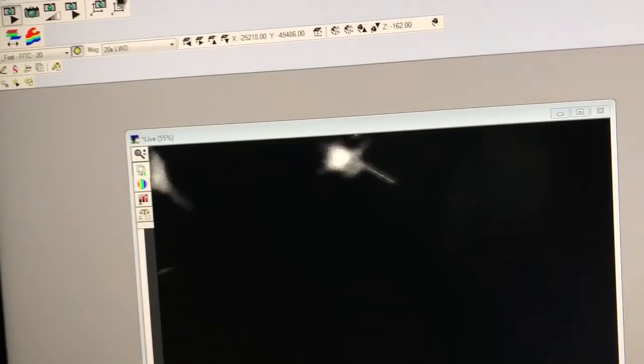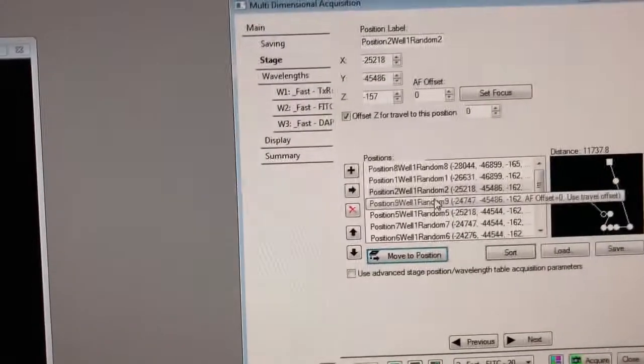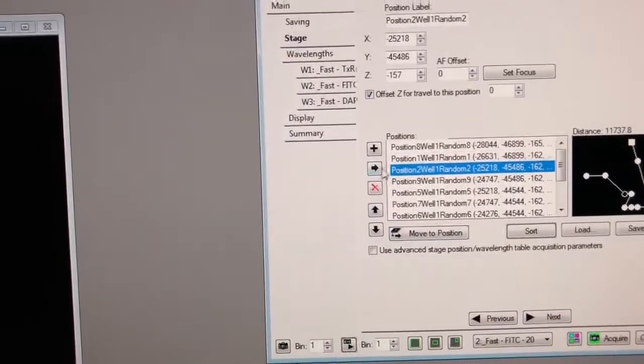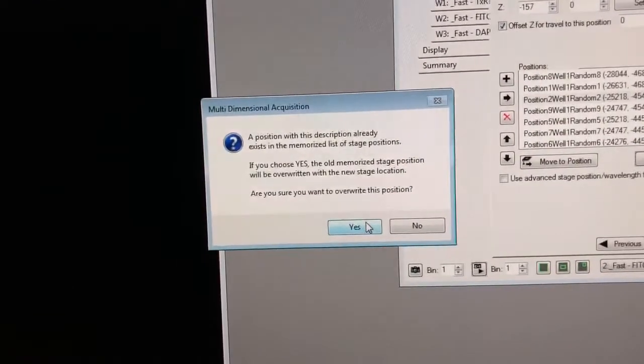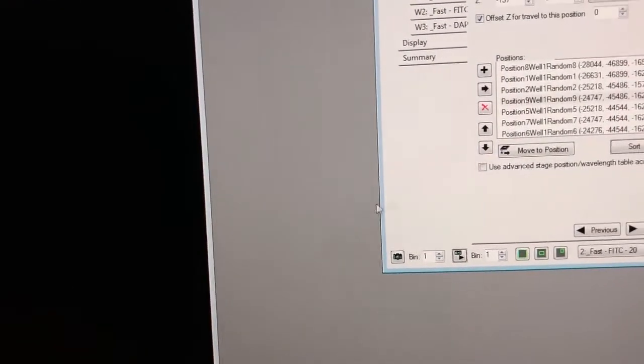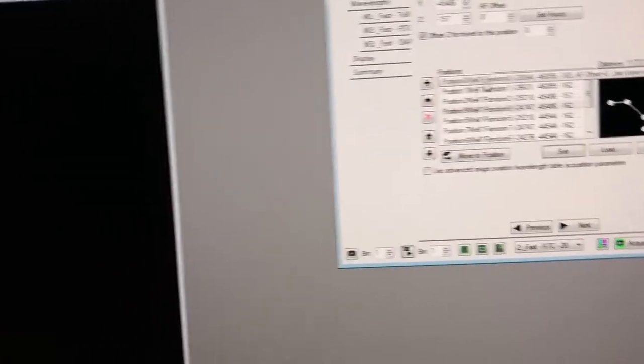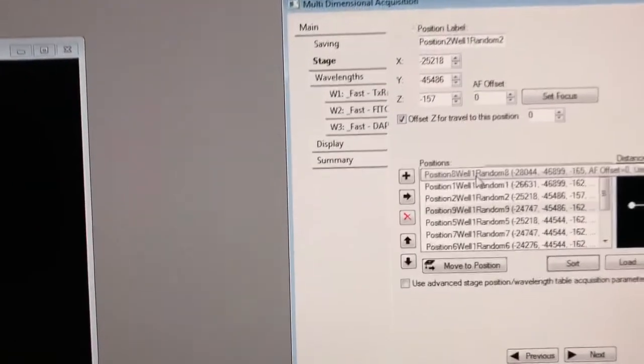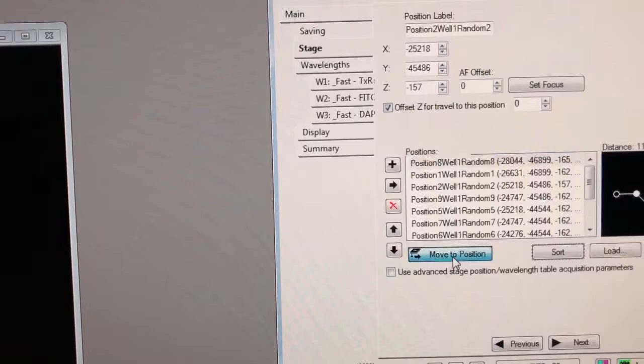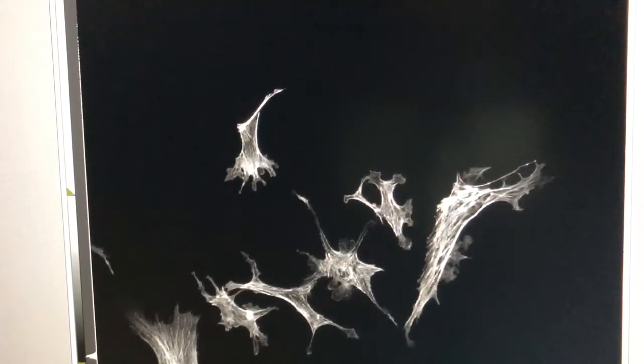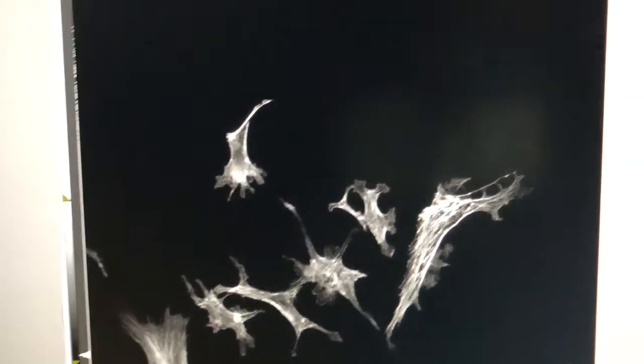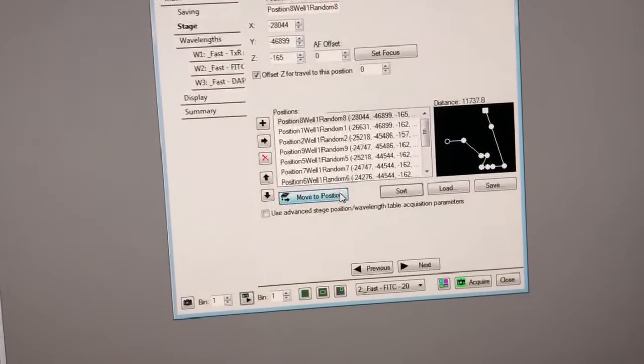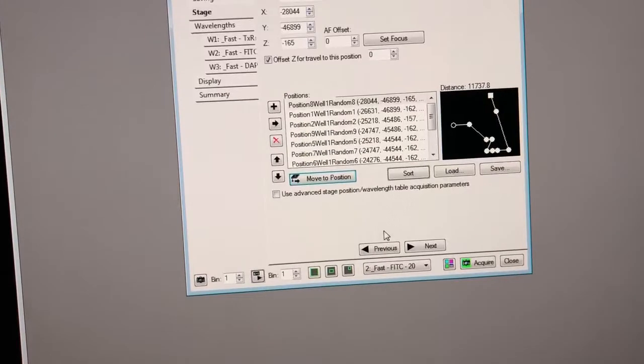So this one the focus looks really bad so let me adjust this. So that looks better and again I click on it to replace it click this it says do you want to overwrite the position yes. So now just to show you that this works remember the first position was out of focus if I go there and say move to position it should be in focus which it is that's because we had adjusted it.